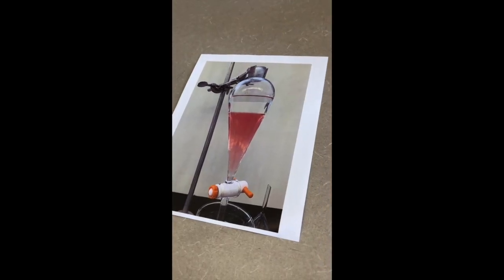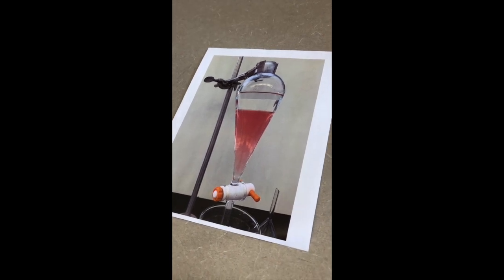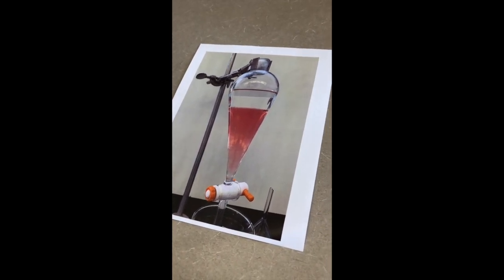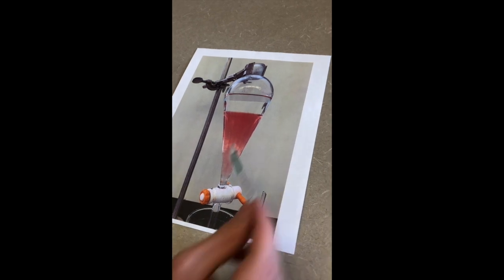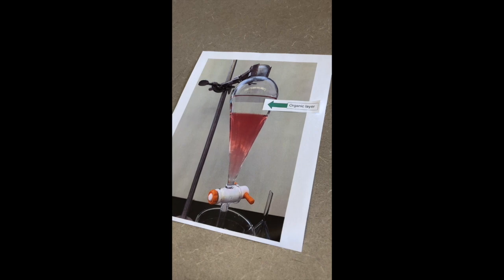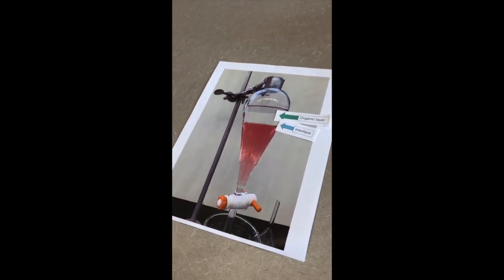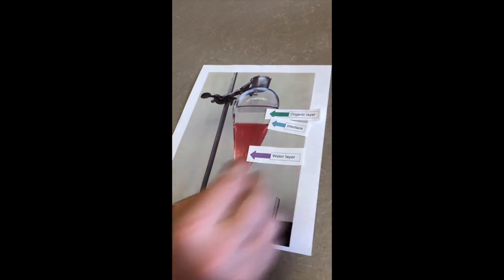So diethyl ether is actually lighter than water, which is a rare case where the diethyl ether will form the upper layer, constituting the organic layer. And just below that layer is the interface that separates the organic layer from the water layer, and below the interface we have our water layer.